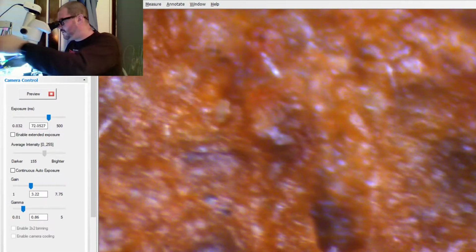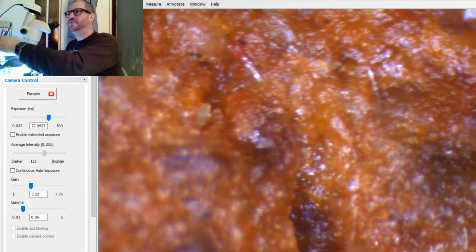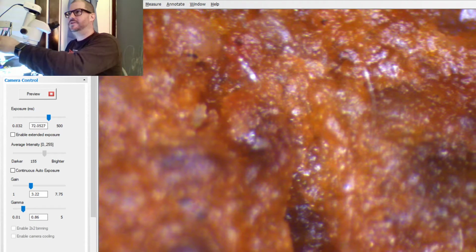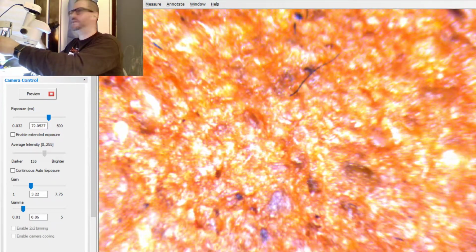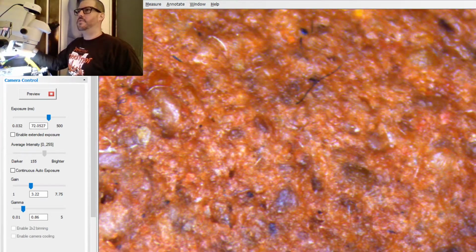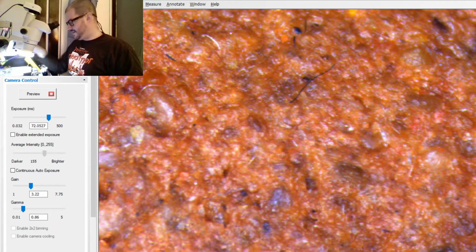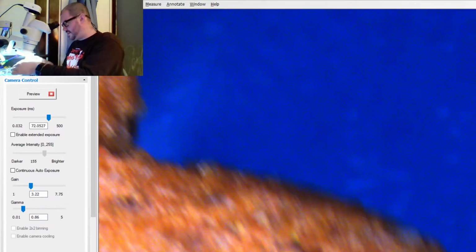It's kind of everywhere. I'm focusing. It's definitely in the food, whatever this happens to be. Dude, that is incredible. I really legitimately don't entirely know what all that stuff is, but it's in there. I'm gonna spin this thing around a little bit and take this over to the other side.